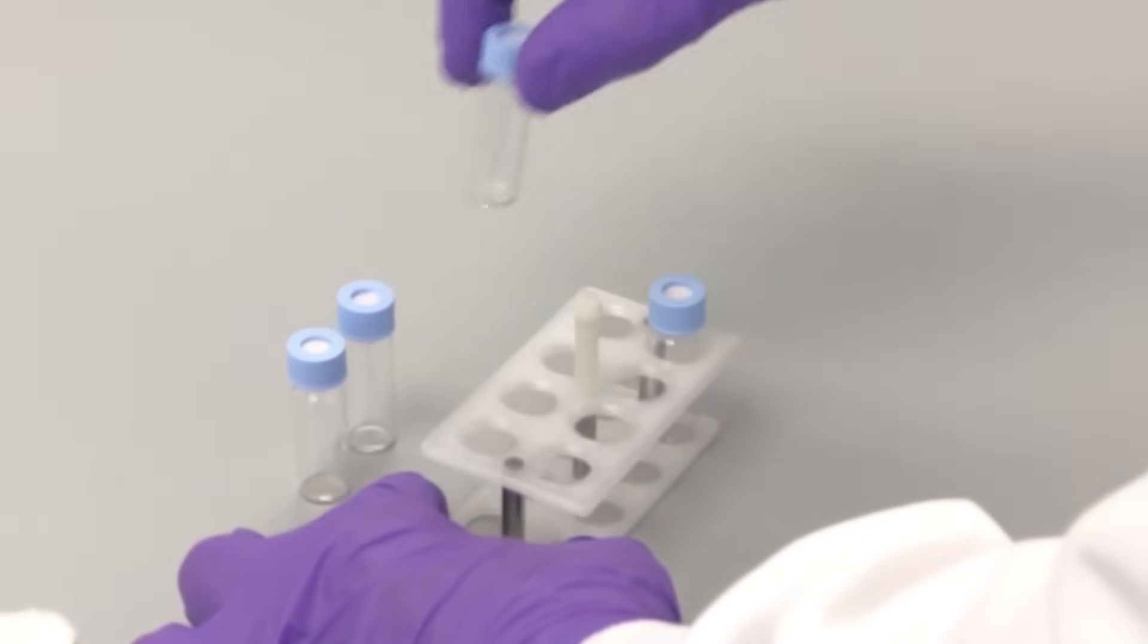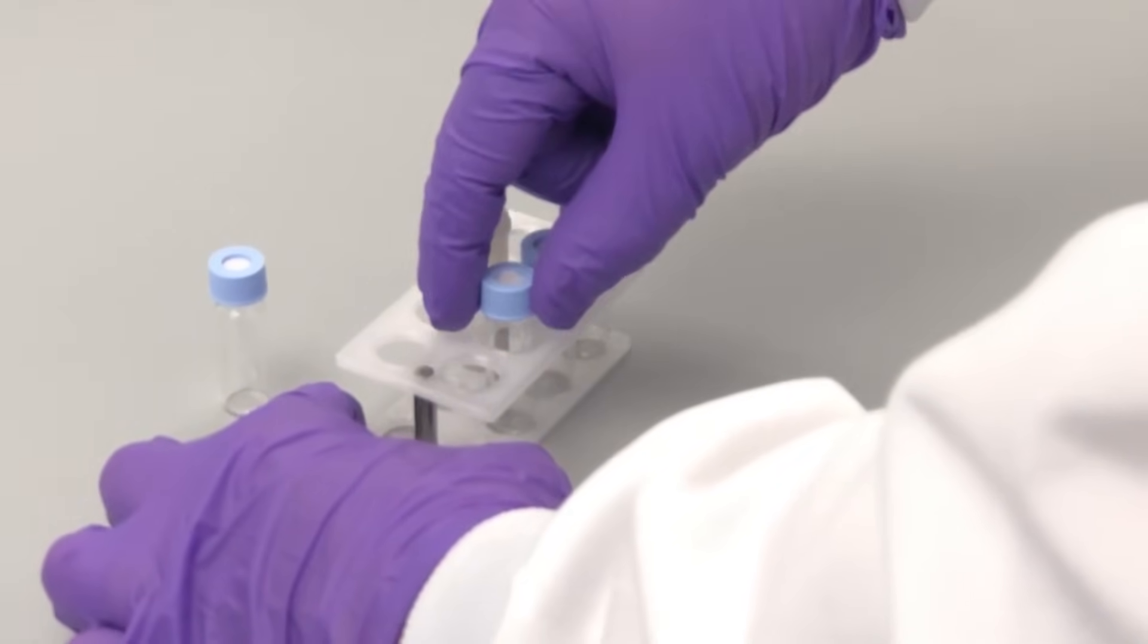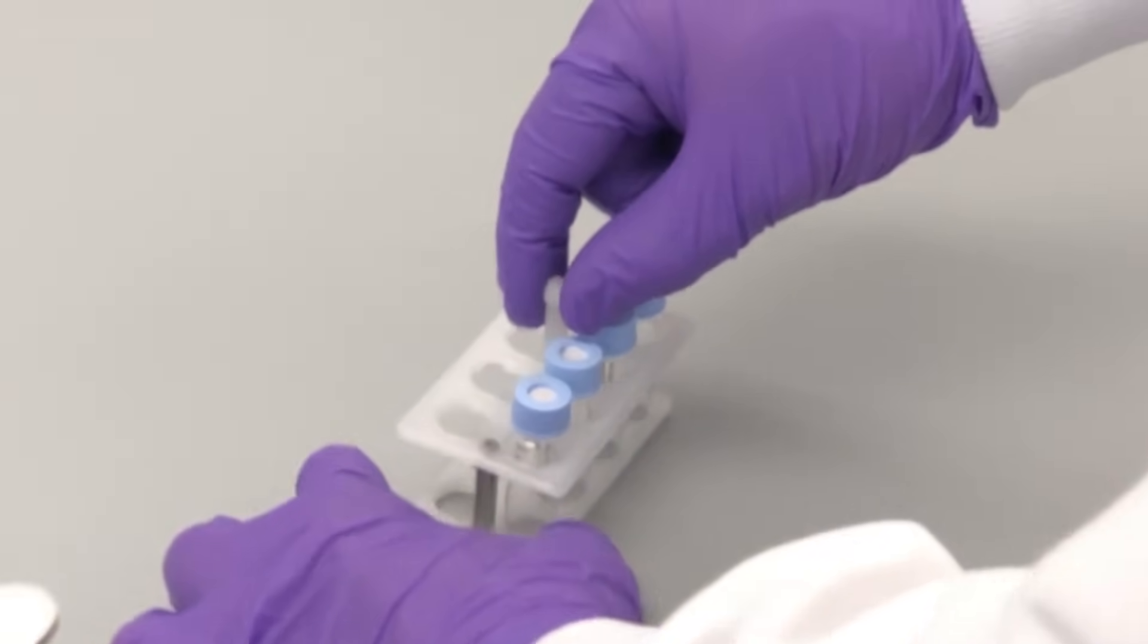All of our vial holders are compatible with the original photoredox box as well as the photoredox box duo and our photoredox TC or temperature controlled unit.